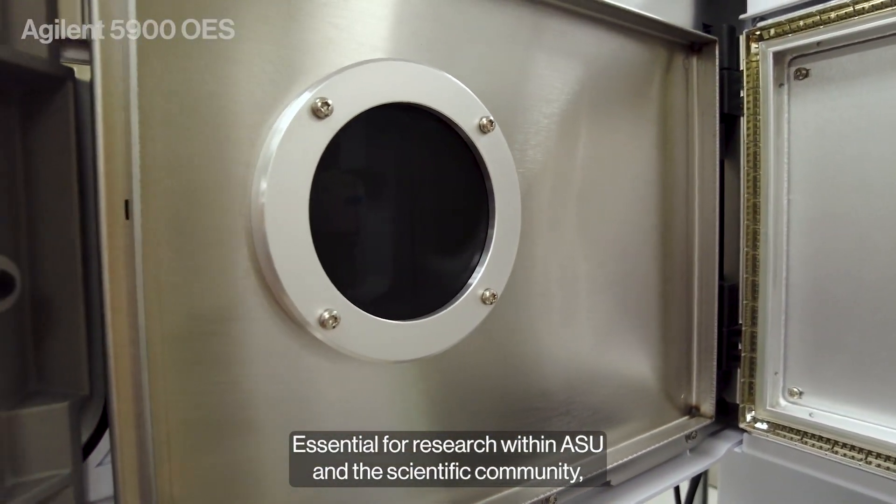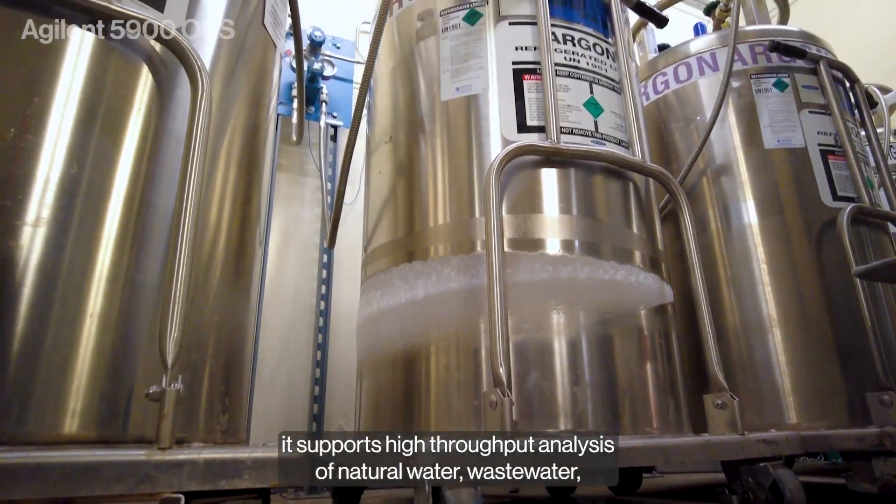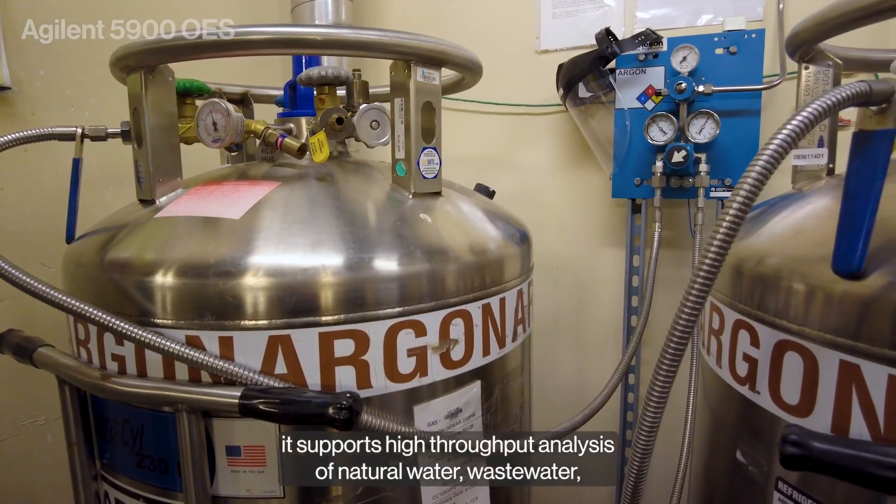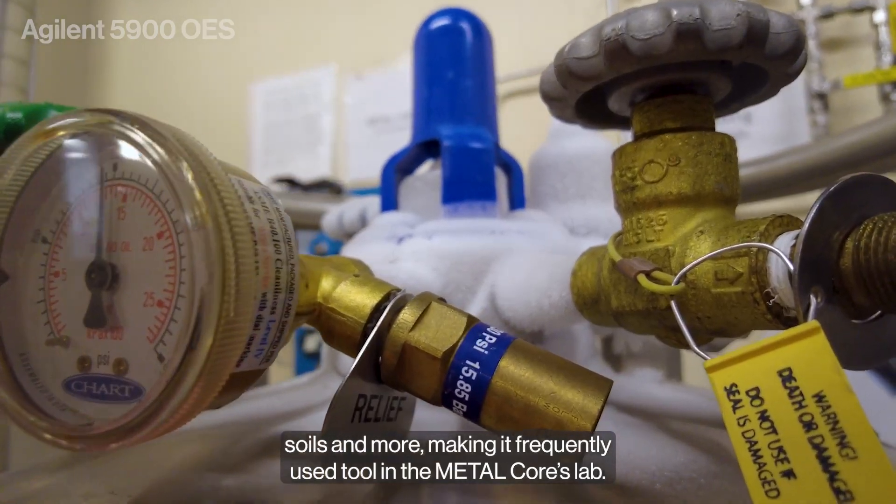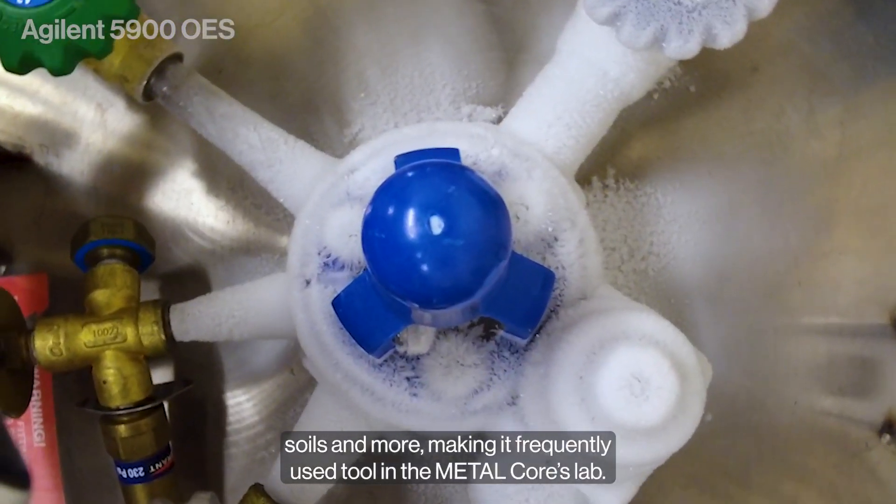Essential for research within ASU and the scientific community, it supports high-throughput analysis of natural water, wastewater, soils, and more, making it a frequently used tool in the metal cores lab.